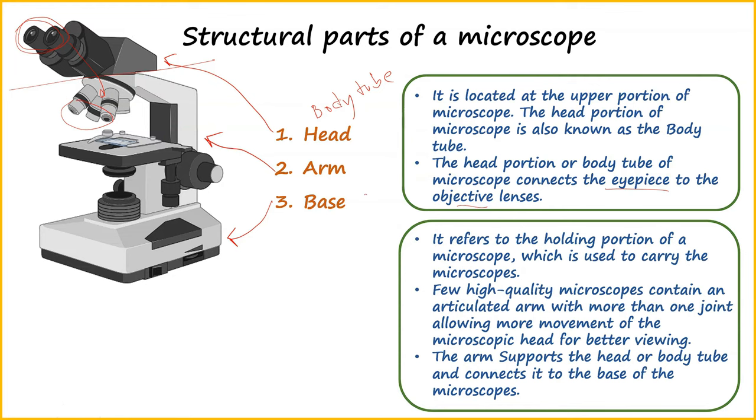Now come to the arm. Arm refers to the holding portion of a microscope, which is used to carry the microscope. This portion is actually used to carry the microscope.